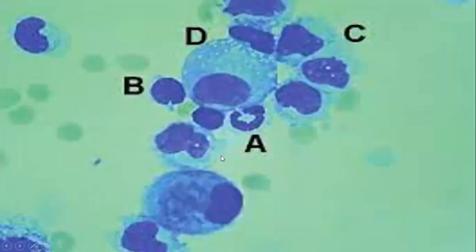Now, this is a Wright-stained synovial fluid, wherein the cell labeled A is a neutrophil, the cell labeled B is a lymphocyte, the cell labeled C is a monocyte, and we have here a histiocyte or macrophage labeled D.